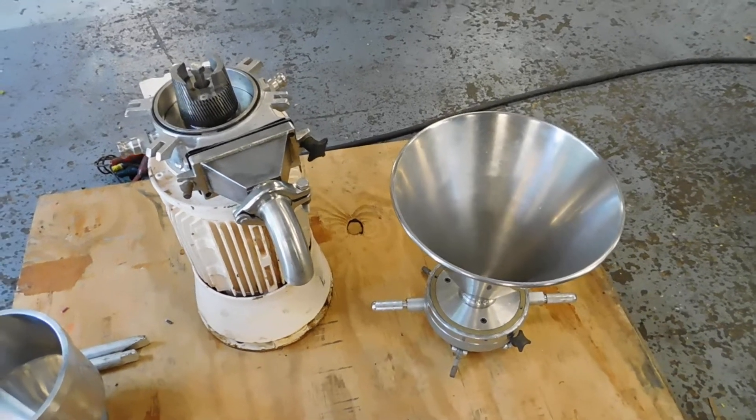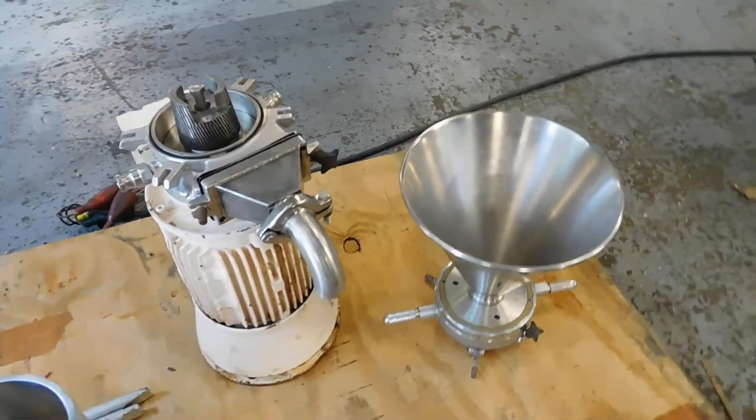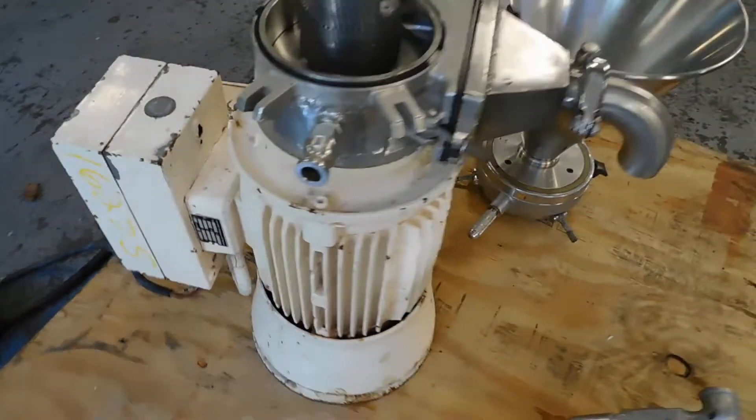Hi everybody, welcome to Champion Trading. What we're showing you today is a Phryma colloid mill, ZMZ 100 model. We believe there's a tag from another manufacturer on there, but we believe that's the sales company — it exactly matches the specs.